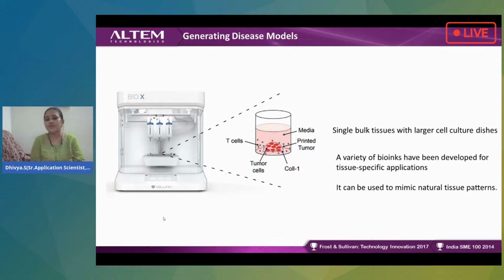And this bioink is going to better mimic natural tissue patterns. I explored more about bioinks in a previous session. Please follow us at Biotechnica and Altem Technologies to learn more about why bioinks are important.